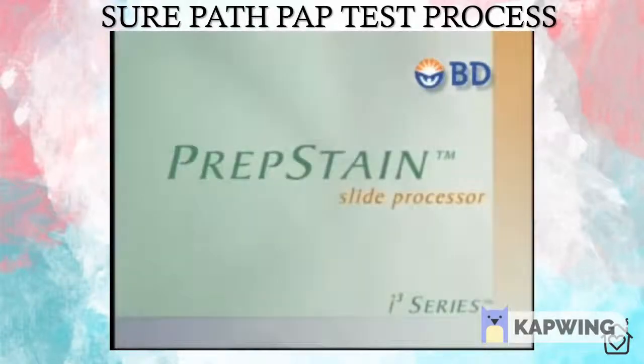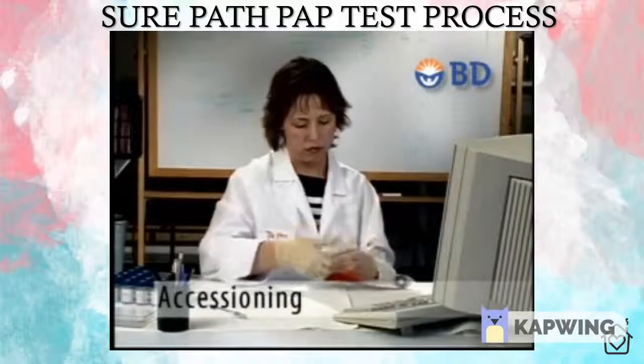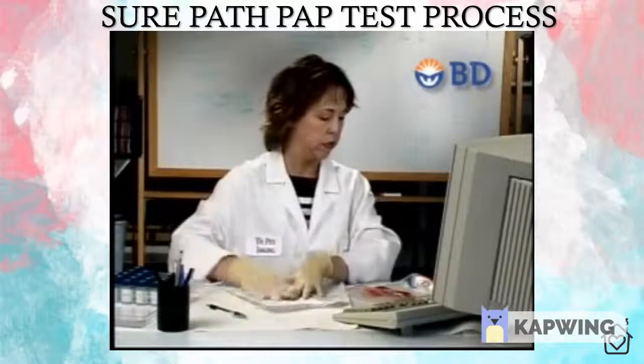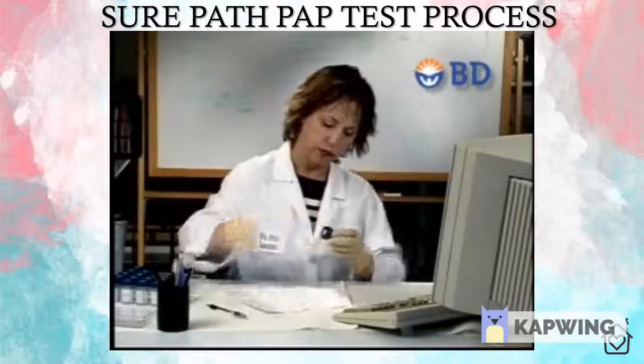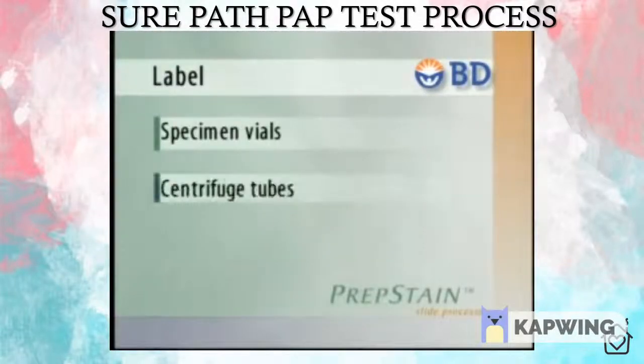Let's take a closer look at the PrepStain process. Cervical samples collected in SurePath Preservation Fluid are received from a clinician's office and accessioned according to the laboratory's protocol. Each vial is checked for proper labeling and is visually inspected to ensure it contains the head of the sample collection device. Specimen vials, centrifuge tubes, and glass slides are labeled. Barcode labels are recommended but are optional.